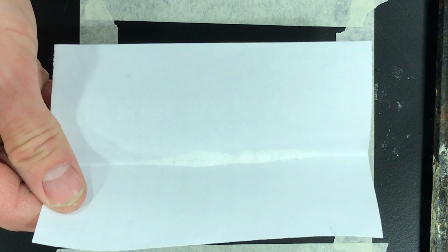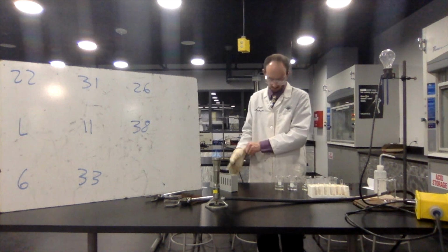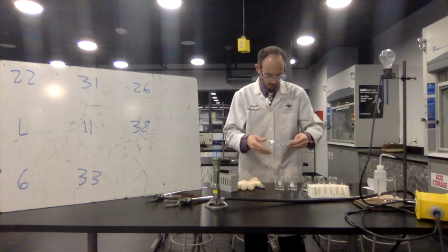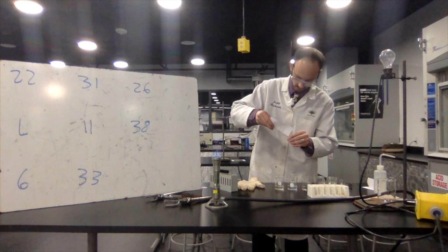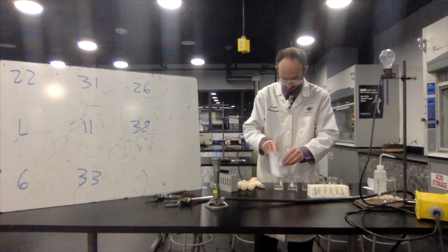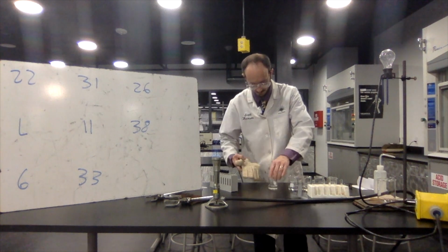And I know that this is going to be pointless, but there we go. You can see the nice thin line on there. Stick my glove on. And no electrical conductivity. We're going to put a little bit of this material in here. Okay. And then we're going to put the rest inside of this one. And now, let's check solubility.